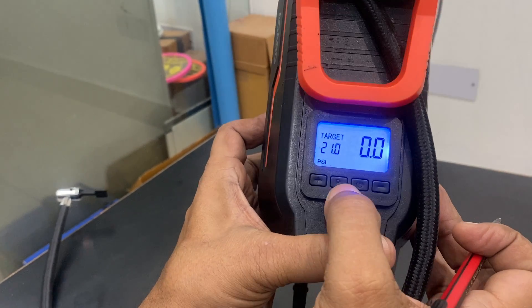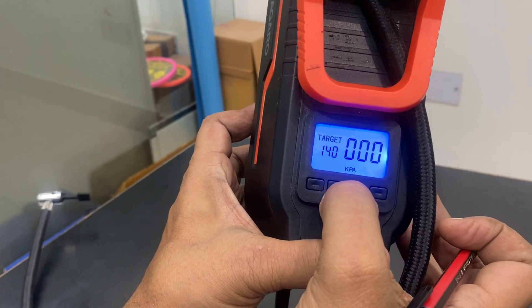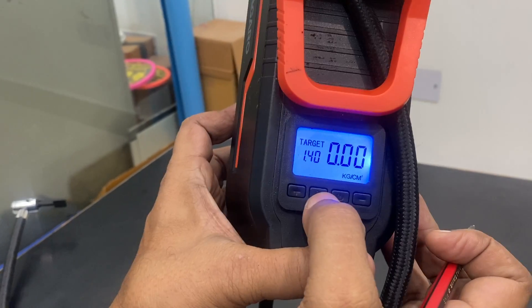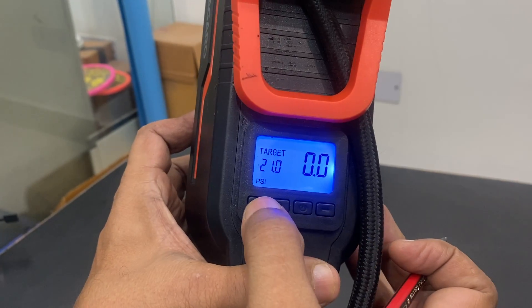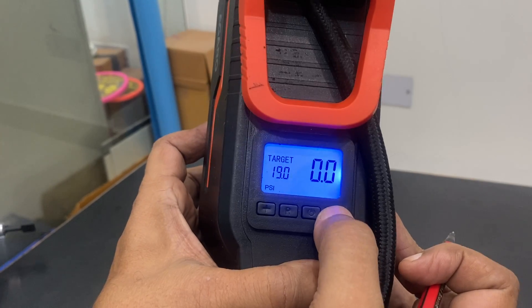This is the switch to change the unit to bar, kPa, or kg per centimeter. I can make it back to psi, and now I am trying to test it at 10 psi.